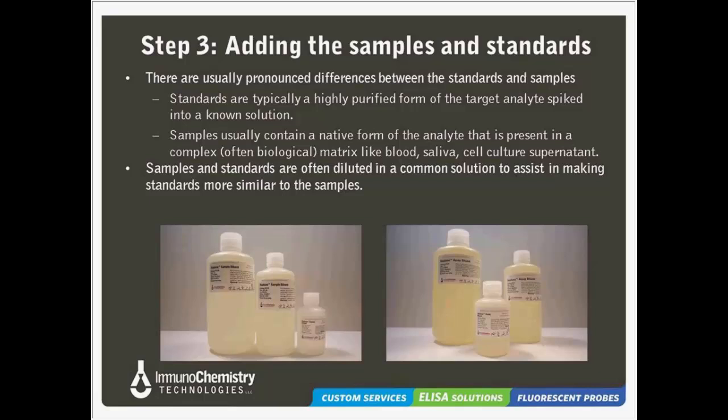In some cases, you can dilute the sample way out and you don't have a matrix effect. If you can dilute your serum matrix out at least 5-6-fold, the matrix issues drop way off fast. But if you have to look at that on a basically neat or 1-to-1 or 1-in-2 type concentration, usually the matrix is big time, and the sample diluent at least lets you dilute that sample out in that process and gives you a stable buffer. So while the samples are sitting on your desk and before you pipette them in, it'll give you a stable buffer to preserve the samples until you get them into the plate.